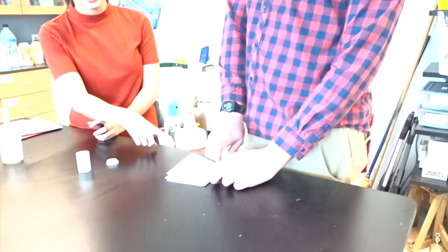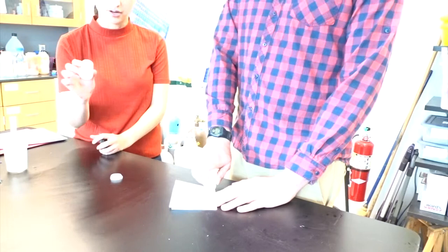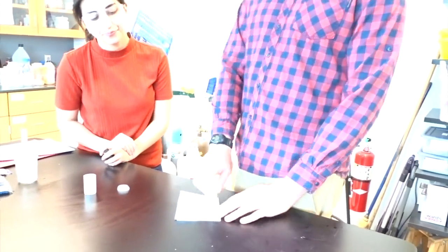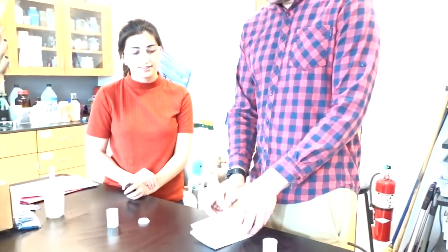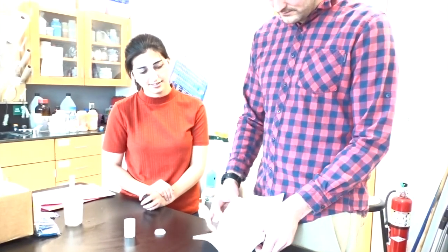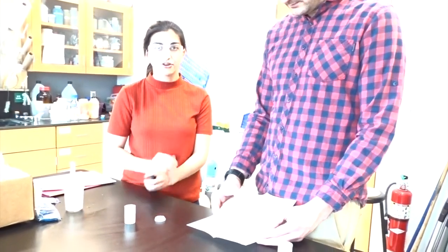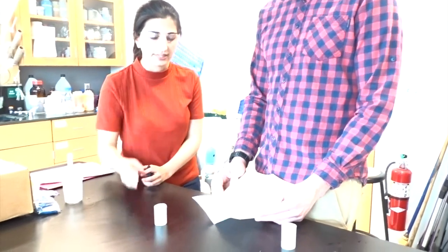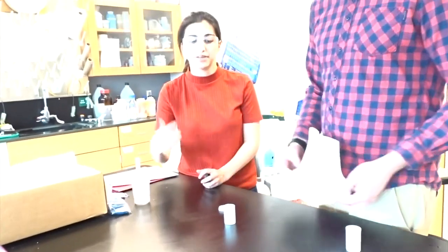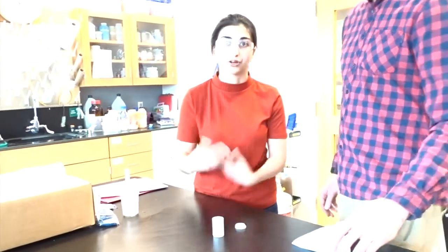So Jan has already taken a quarter tablet and placed it in folded paper. He has crushed it using the bottom of the film canister, and you should tell the students to do the same. Excellent. So now that we have our crushed tablet, we're going to go ahead and add it to our film canister. It's important to add the tablet first, so that when you add water, it will allow a mixture to occur, and the reaction will be more complete.